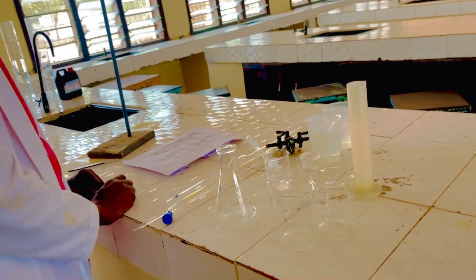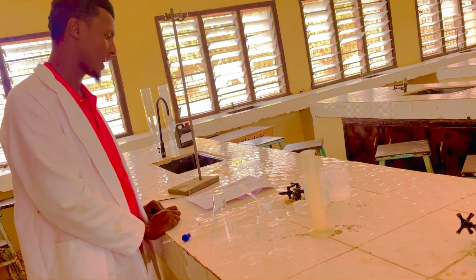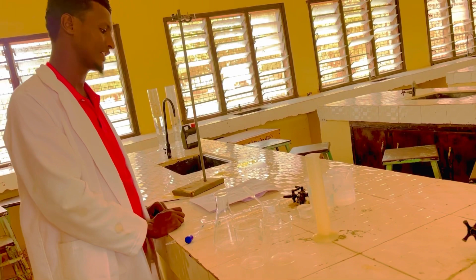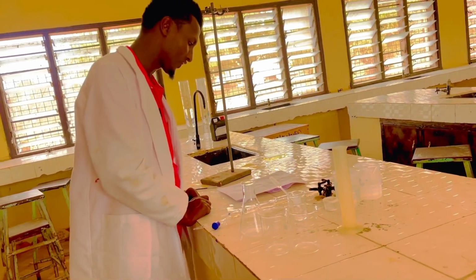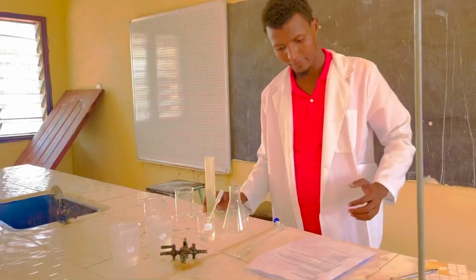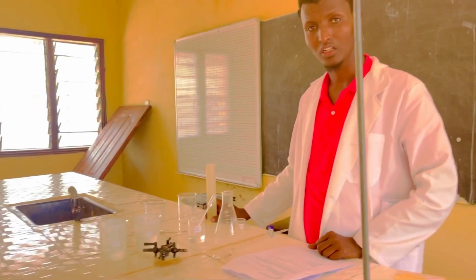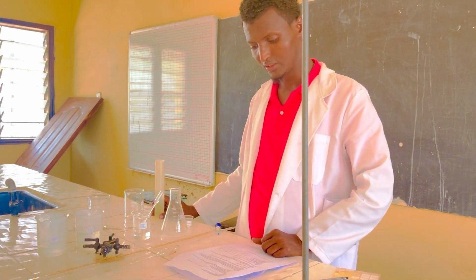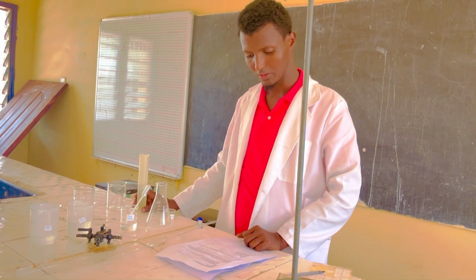Measure 60 cm³ of 1 molar hydrochloric acid using a measuring cylinder and transfer it to a 100 cm³ beaker.